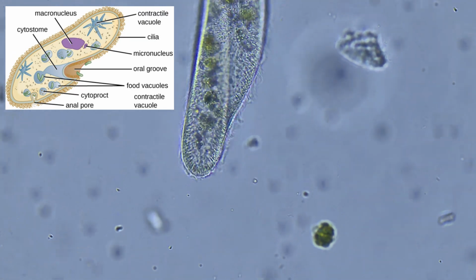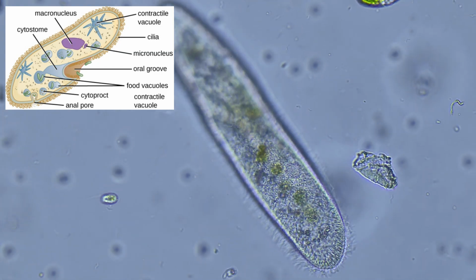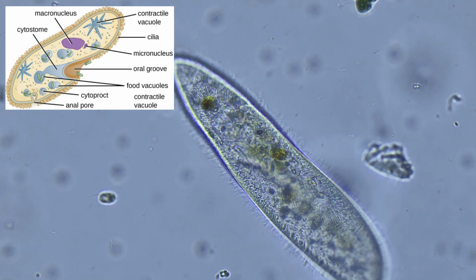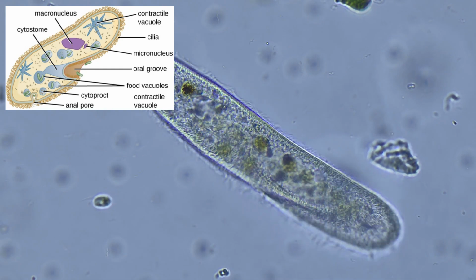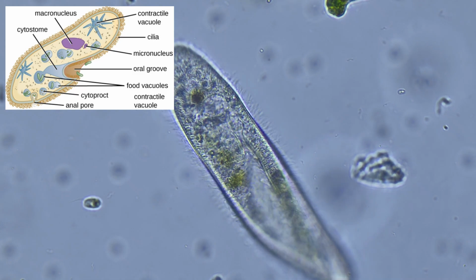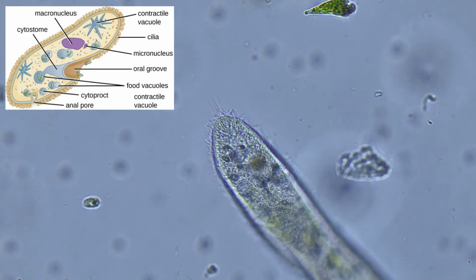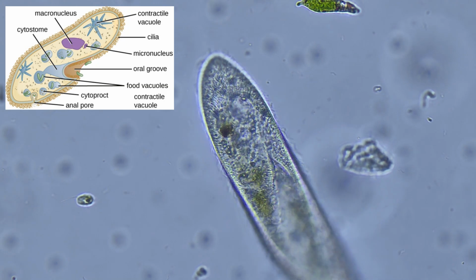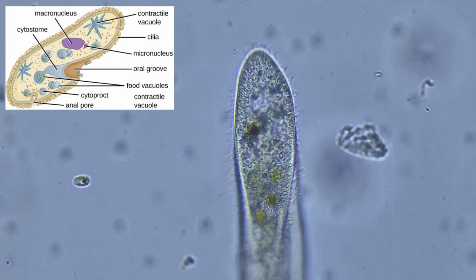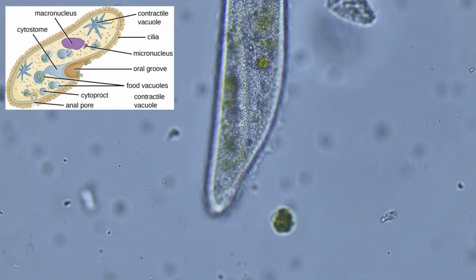Note that this is light microscopy, and light is penetrating through the Paramecium, and the colors are picked up through the various lenses of the microscope. All those lightly colored green and yellow to clear-like round objects inside of it are organelles, or tiny organs. They're kind of like organs to us as humans are, and they complete various tasks to help keep them alive. Now let's find another specimen that isn't moving quite as much and see if we can make out some other structures.